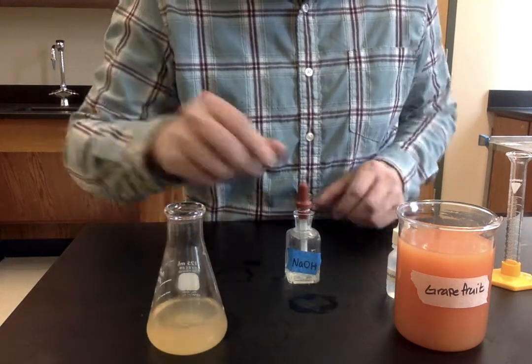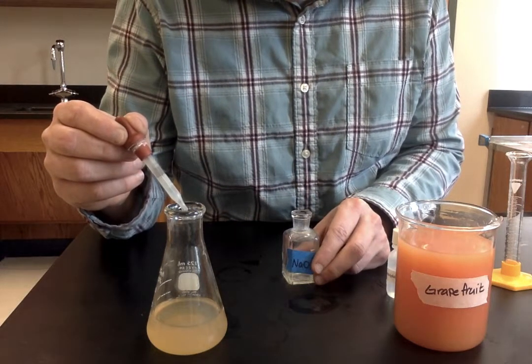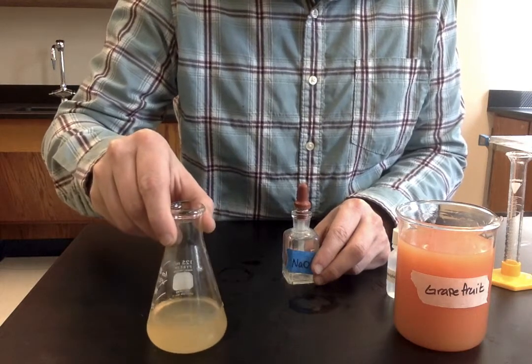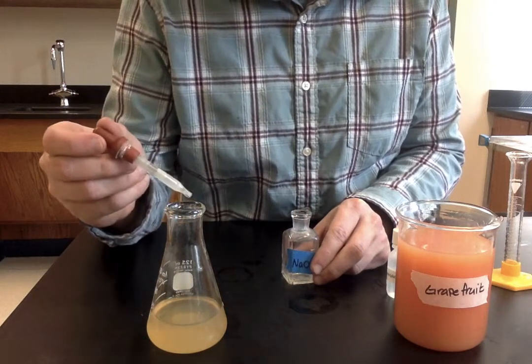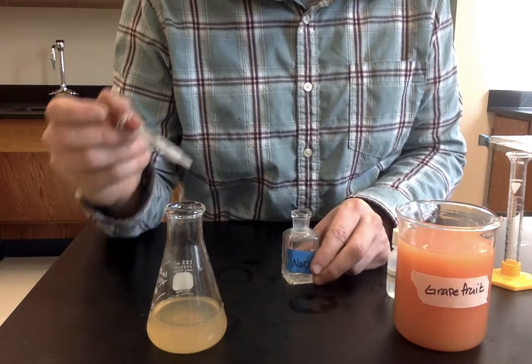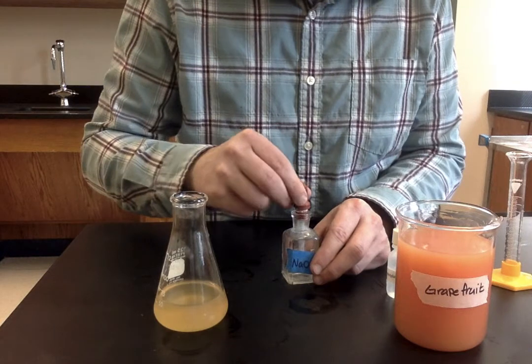Okay, so no real color change yet. Starting to see the color really linger at the top of the solution, which means that we're getting close. No color change yet though.